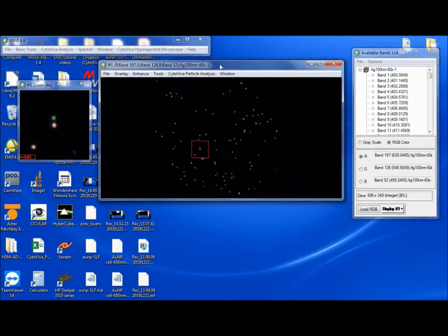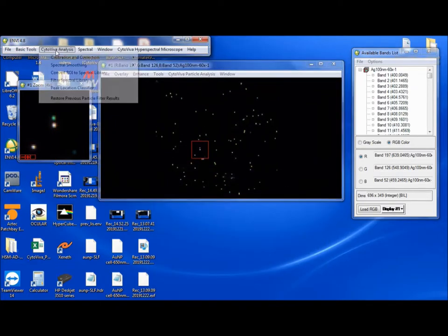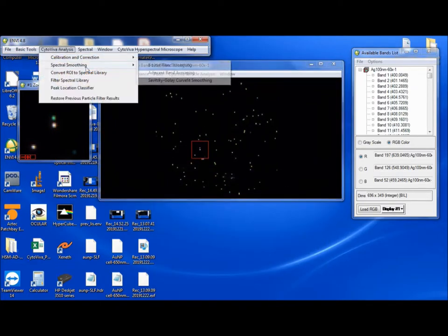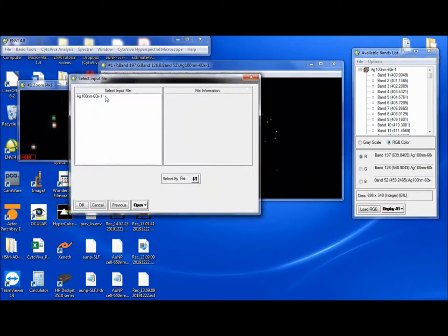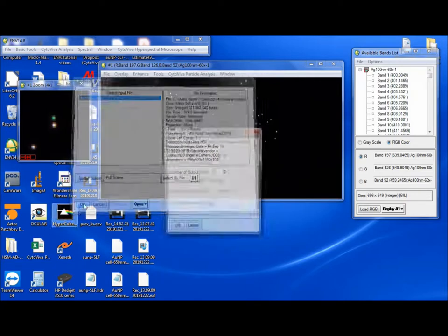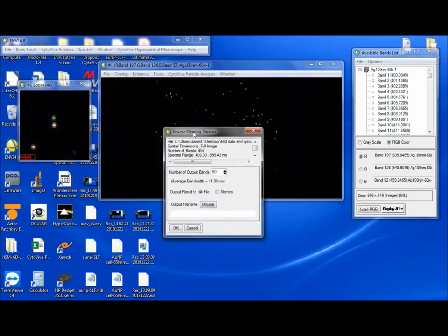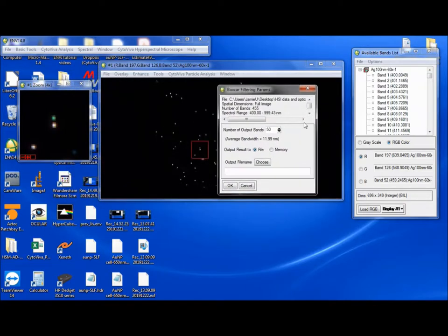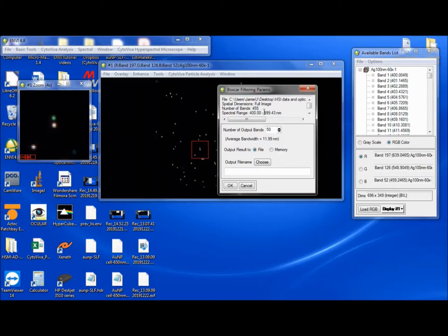So we'll start with the first one, which is the boxcar filtering. And whenever you open these up, you have to, of course, select what file you want to apply it to. So these are the parameters here. It shows you here the name of the image, the full image, and the number of bands. In this particular scan, there are 455 bands that we see from 400 to 999.43 nanometers.